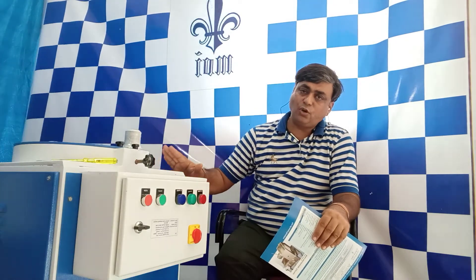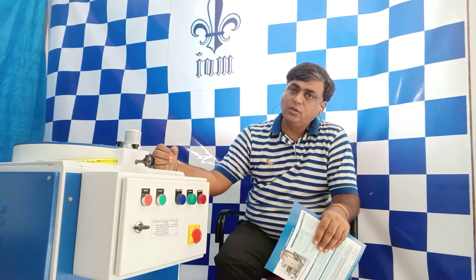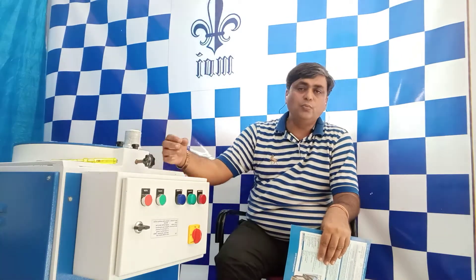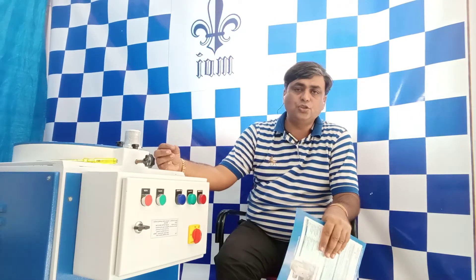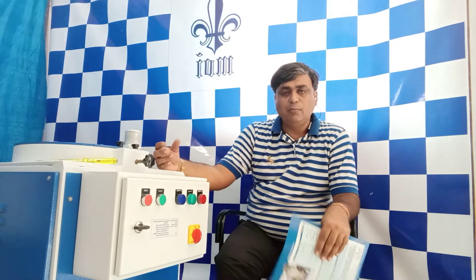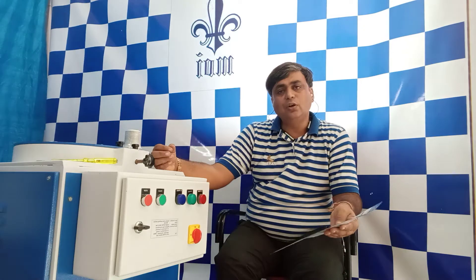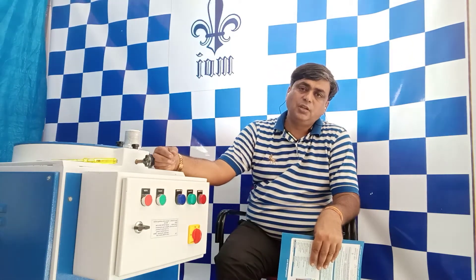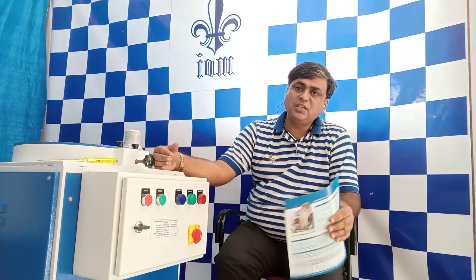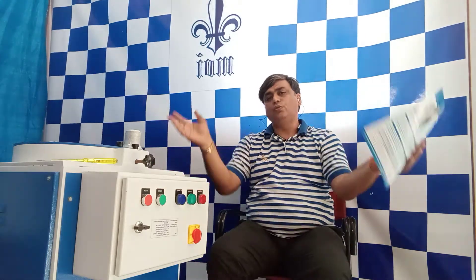The model I am sitting with right now is our export model. We are exporting to several countries: Europe, Russia, Georgia, South Africa, Bangladesh, Sri Lanka, and a couple more countries in Africa. Hence I am discussing this machine with all of my customers all around the globe.